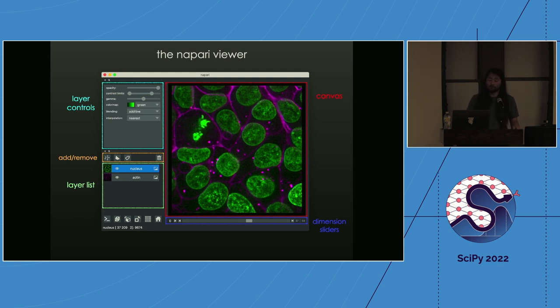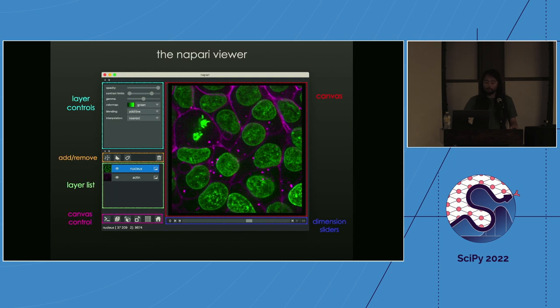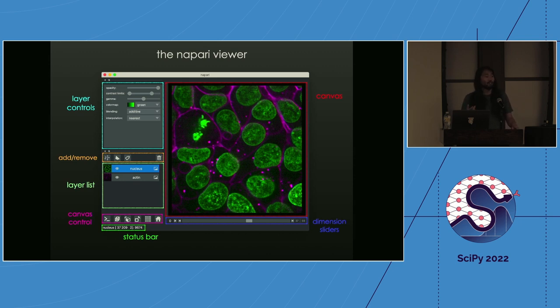You can add and remove layers, control whether things are displayed in 2D or 3D rendering, and select which dimensions are currently being rendered in the canvas controls in the lower left-hand corner. Finally, we have a status bar which, when you use your mouse in the canvas, lets you inspect what's underneath it — for example, the current intensity value of a pixel you're mousing over.